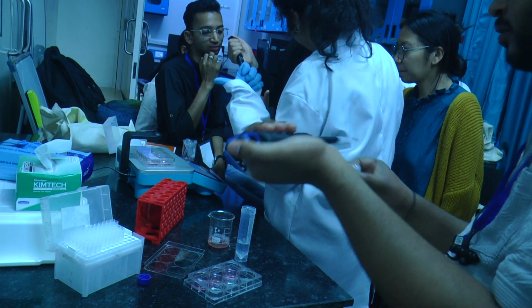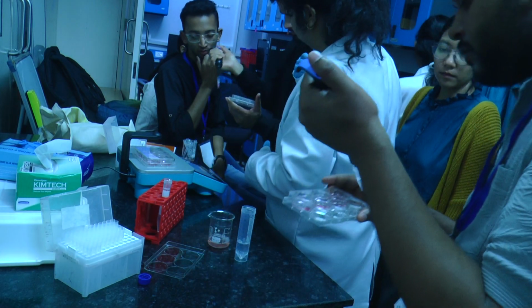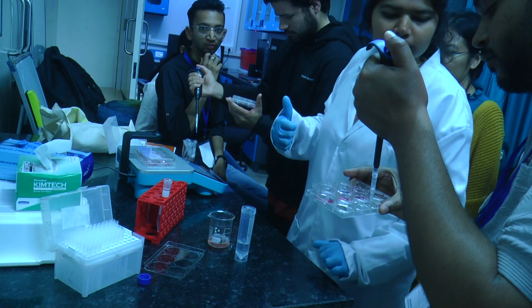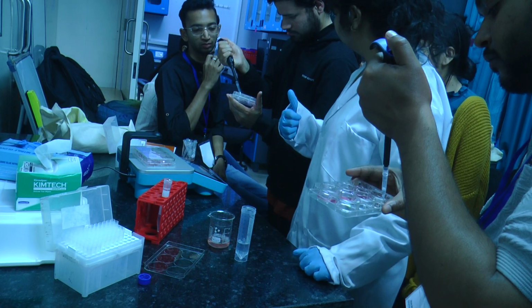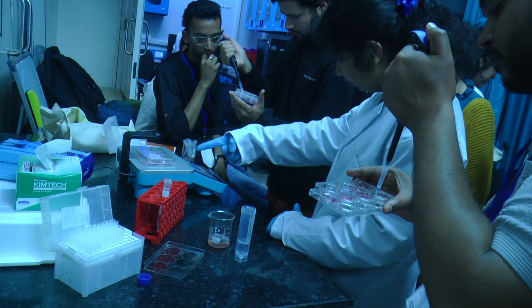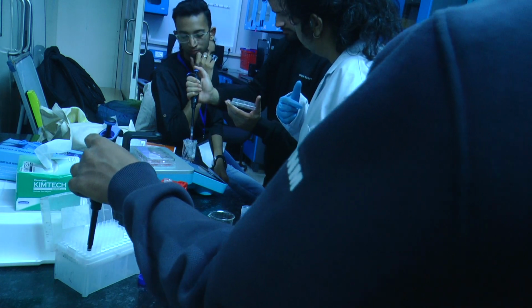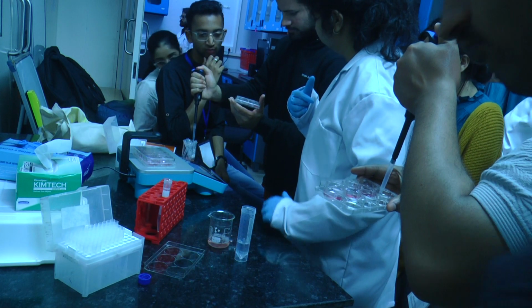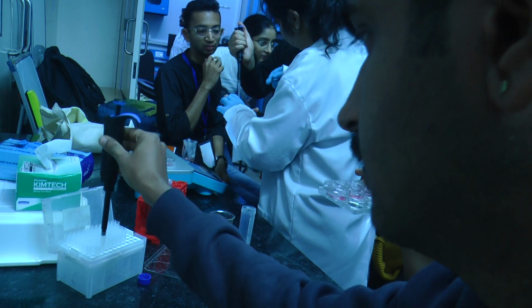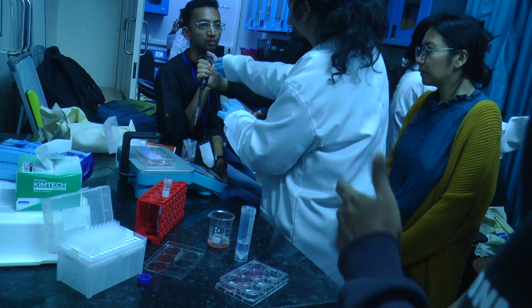Slowly, completely cover the surface, that's it. Done. Keep it, we can use it.